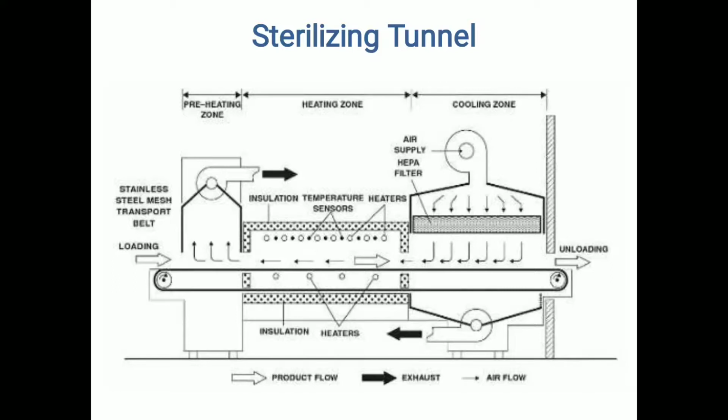The preheating zone mainly consists of a stainless steel mesh transport belt. There are provisions for loading as well as unloading the materials.